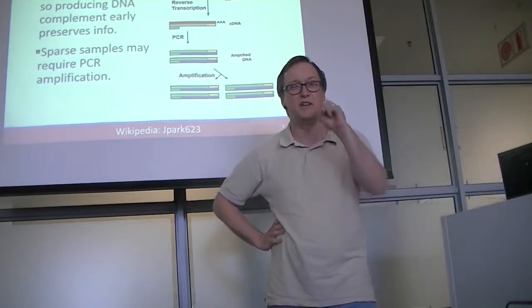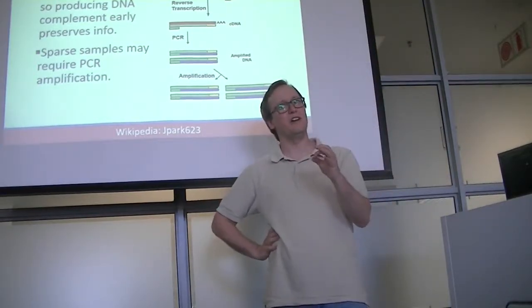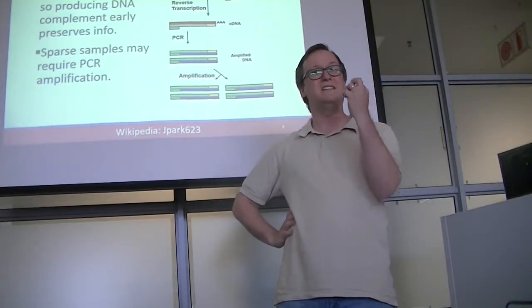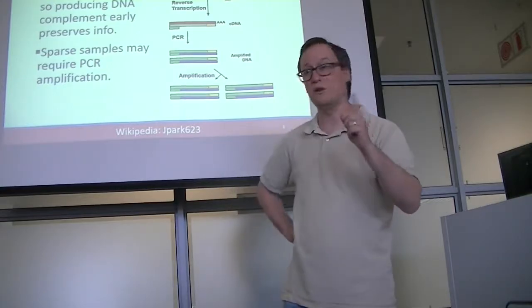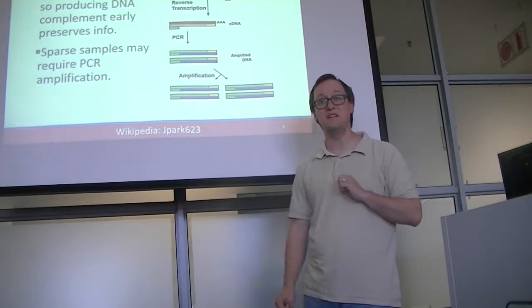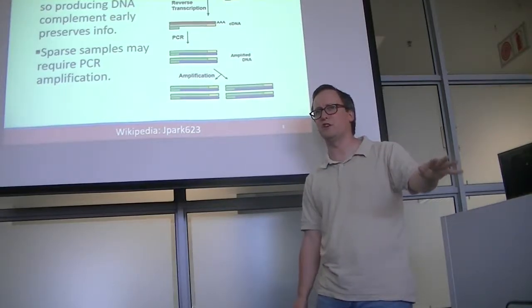If you look at them funny, they dissolve, right? They go away, they get digested by something. So messenger RNAs are really kind of shady customers, and we want them to be nice and stable for us to measure them. So one of the first things that you frequently find we do is to produce complementary DNA, cDNA, from it. Is this familiar to everybody already?